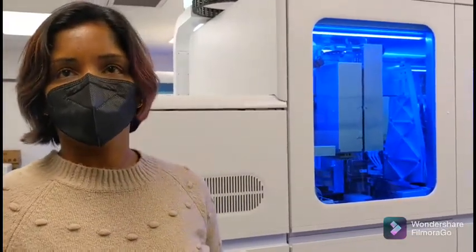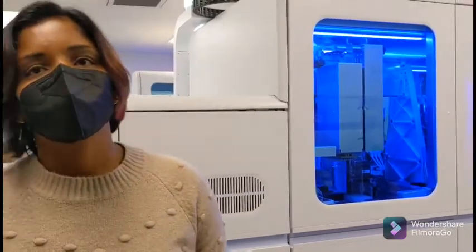And we don't find out when we get tested what variant it is, do we? We do not. That is done primarily for surveillance purposes. So we do share that information with public health. And public health has all the connecting information in case they want to investigate further, do contact tracing or anything else with that data. You're seeing Omicron.